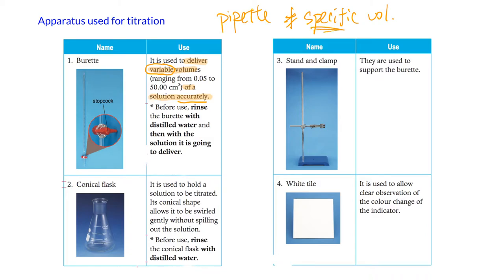You have to remember the correct way to wash the burette. You need to wash it with distilled water first, and then wash it with the solution that is going to be delivered. In an exam, if you're filling it with HCl, you have to say you rinsed it with HCl — you can't be too general.